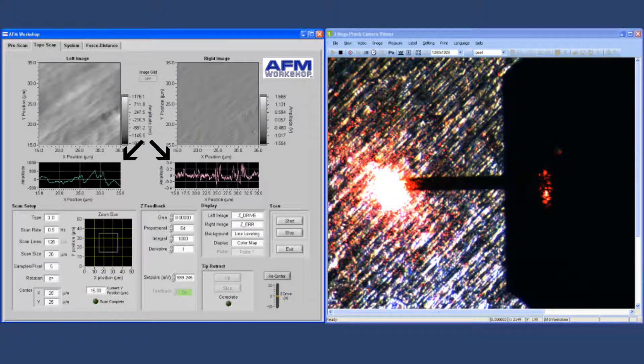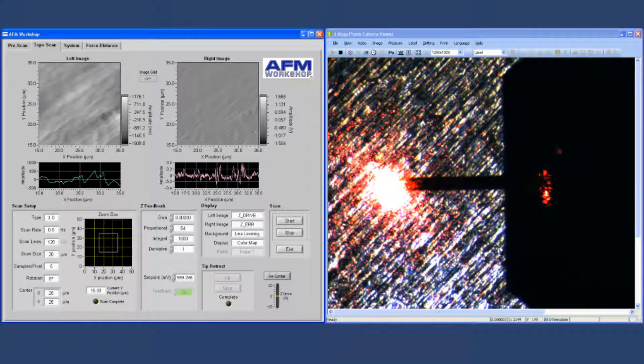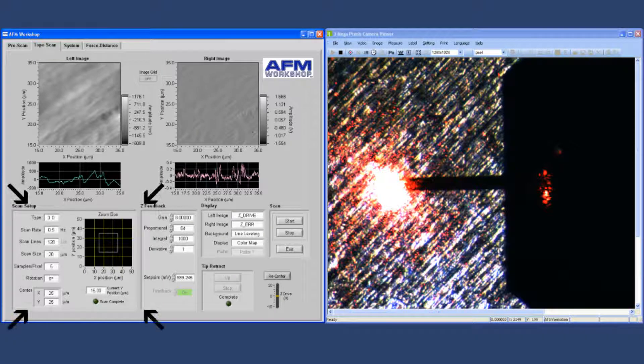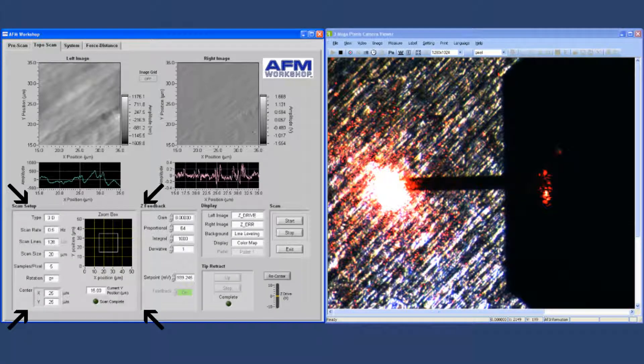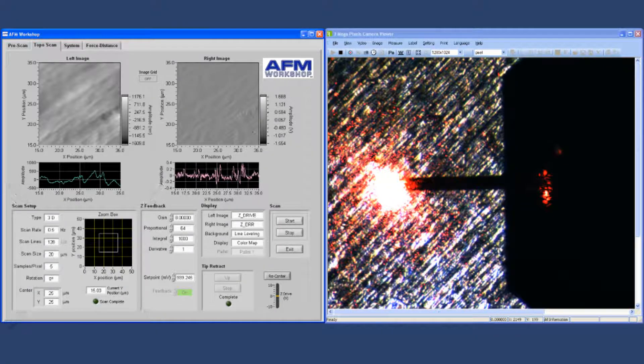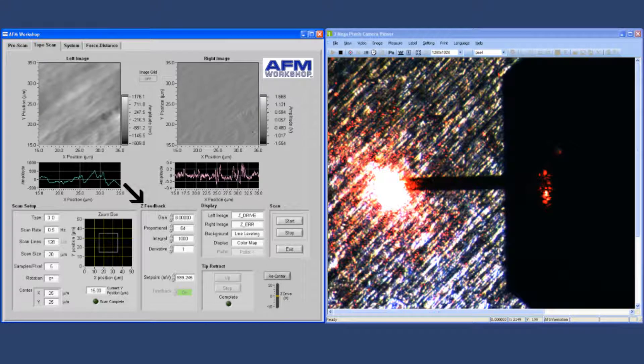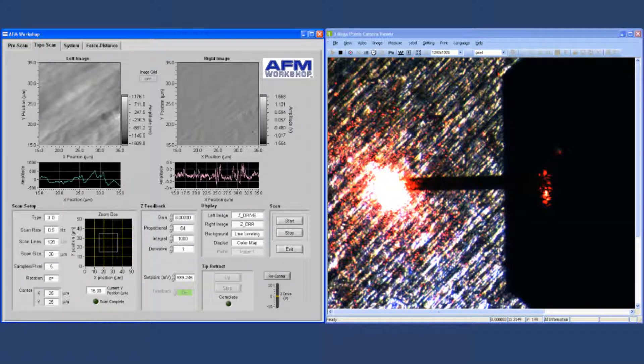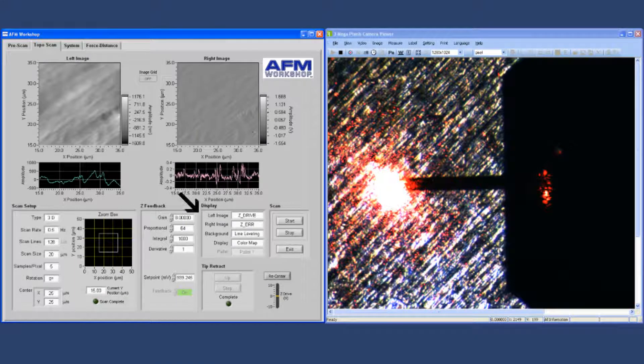At the bottom left are the scan setup parameters, that's the scan area and the scan range. Next to that is the Z feedback parameter settings, and next to that are the display settings, which are used for selecting the channels for display and the visualization of the display in the microscope image.